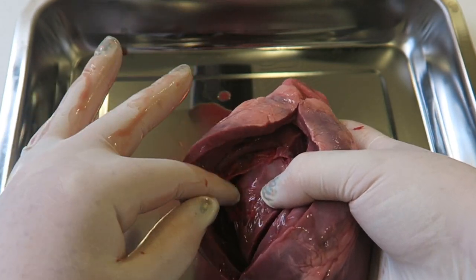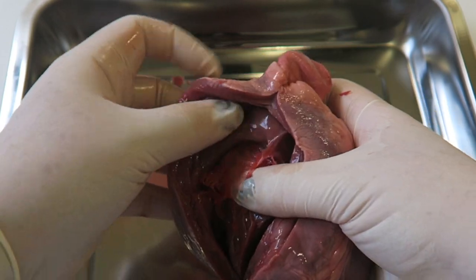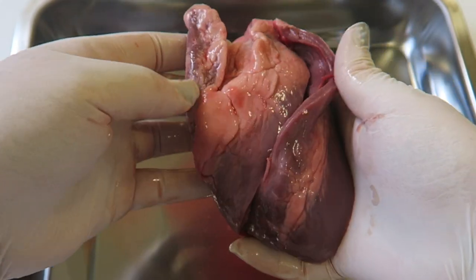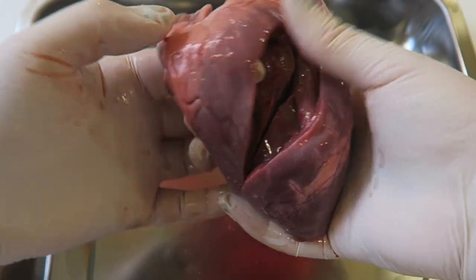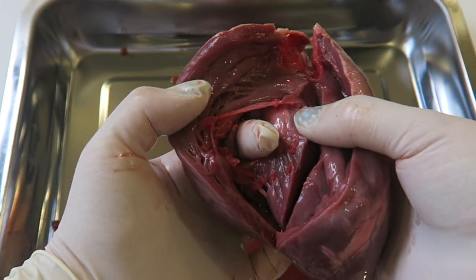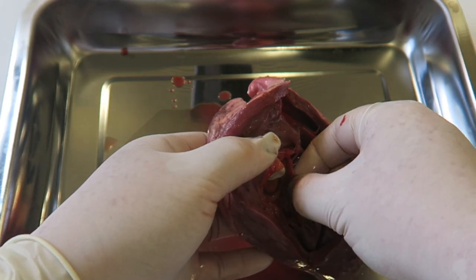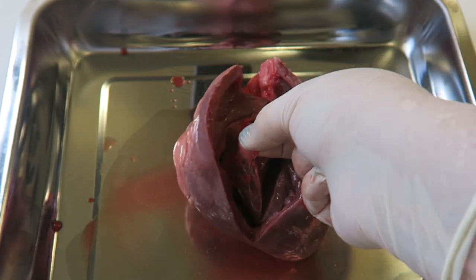Much, much thinner over this side, but we've still got these valves in place for the unidirectional flow. So coming out of this one here, blood will go in through here, into this chamber, in through here, and you'll see it will come out through the smaller top chamber, past the unidirectional valve in there. You can see these tendons again, really, really thin, but really, really strong.